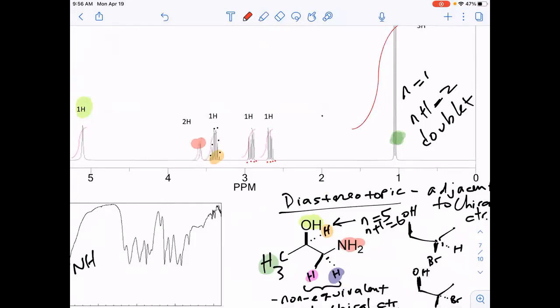But let's just take the pink one, right? We know why they're downfield like they are. The pink set and the purple set, one of those signals is going to be for purple. But the reason why it's 4 lines is because of that non-equivalence. Normally, they would be a doublet, because it's not going to split with the NH2 at all. So it would only split with the 1 proton next door, which is the orange one. So it would just be a doublet.